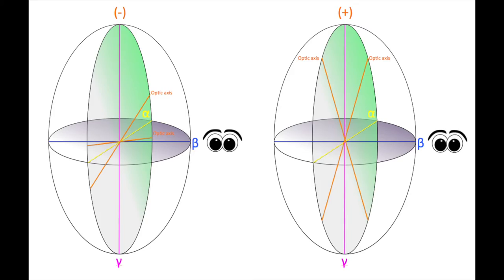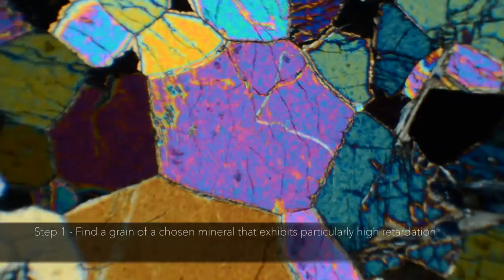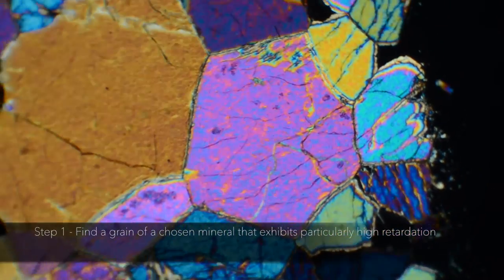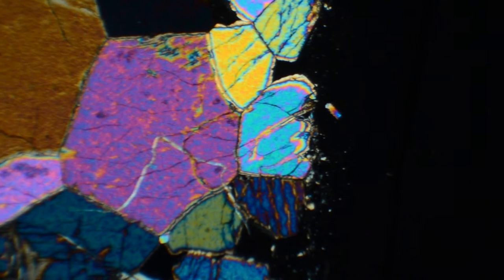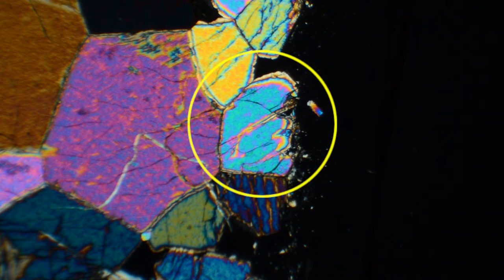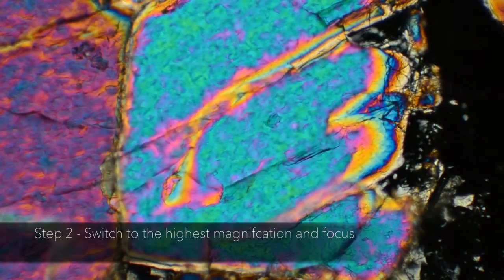Now let's go through the steps to acquire a flash figure. Step 1: With the cross-polarized lens in place, find a grain of a chosen mineral that exhibits particularly high retardation and interference colors. Step 2: Switch to the highest magnification and focus.